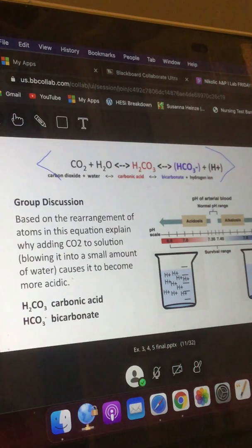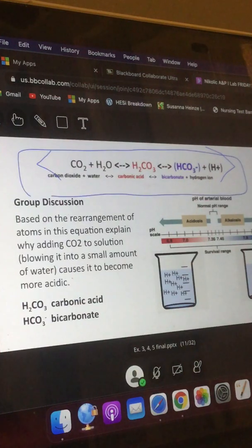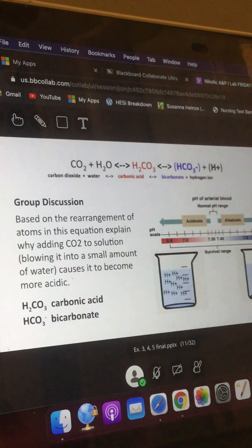So we're going to actually show how this works in terms of a buffer, if I change the pH, what the buffer will do if I add more, in this case, I make it more acidic. Okay, exactly. So here, this is the equation, right? I actually really like this slide because this kind of sums it up, right? And this equation sums up what's happening in the experiment. Okay, so what we have here is carbon dioxide. That's what would be called the initial condition, right? I have water, here's my water, and then I blow in it. So I'm going to blow carbon dioxide, right?